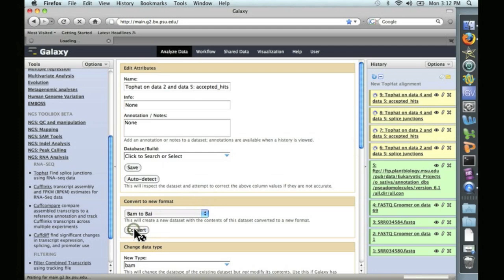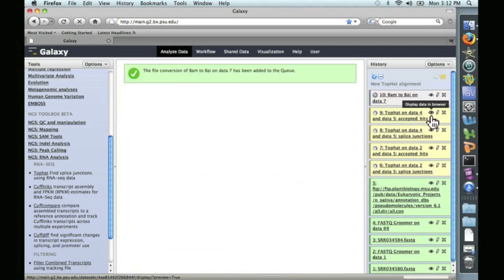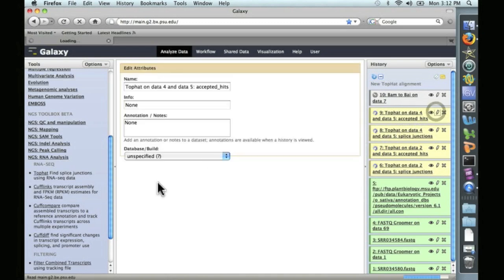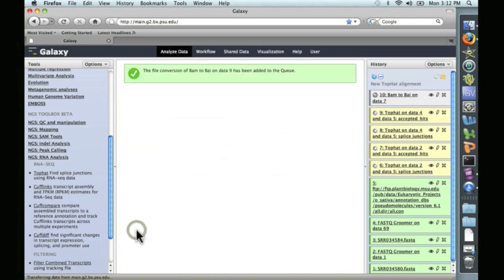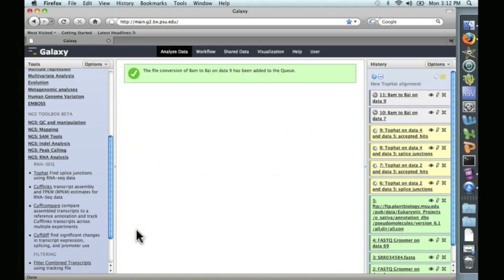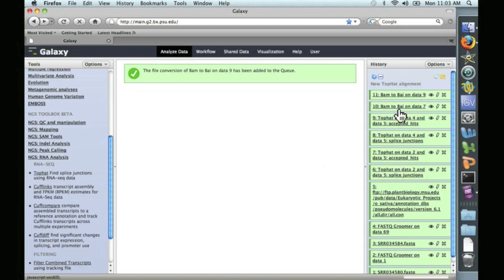And as before, we create the BAI file by editing attributes here and convert to a new format: BAM to BAI. So we'll queue that up. We also need to do the same for this dataset. We'll edit attributes, BAM to BAI. We'll queue that up. And we're all finished. We've finished both of the two TopHat alignments and the creation of the two BAI files.